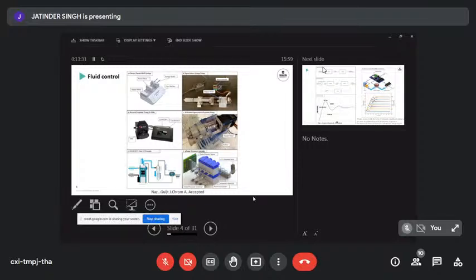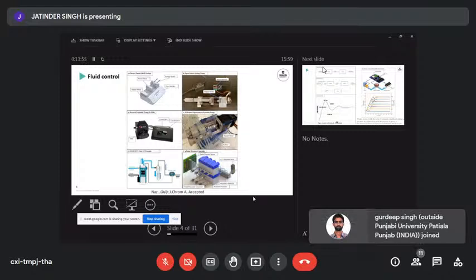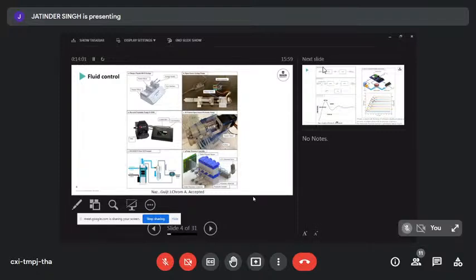Peristaltic pumps are another class of pump. The difference in their operation is that a syringe pump has a little stepper motor that pushes the plunger forward, so you get relatively pulseless flow. Whereas with a peristaltic pump, the roller rotates around. Every time the roller squeezes the liquid together, you get a pulse, and then it relaxes, so you get very pulsative flow.